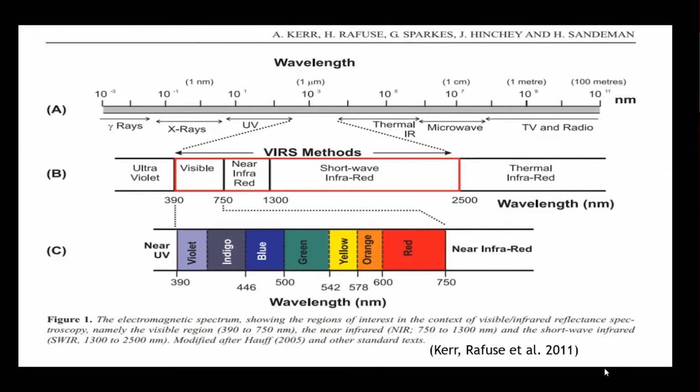The reason that we focus on SWIR and white micas is because the ALOH feature occurs at 2200 nanometers. Other important features are the MGOH feature at 2340 and the FeOH feature at 2260. So again, this is why we're going to focus on SWIR today.